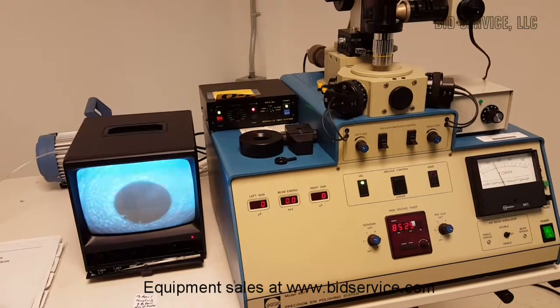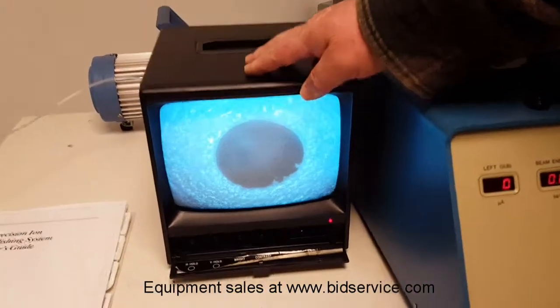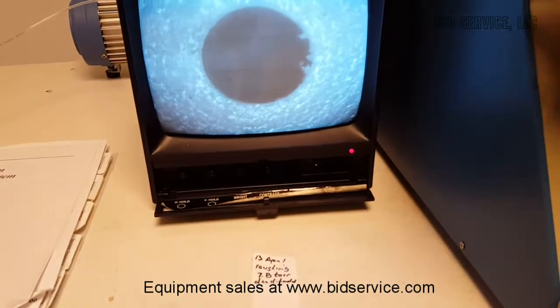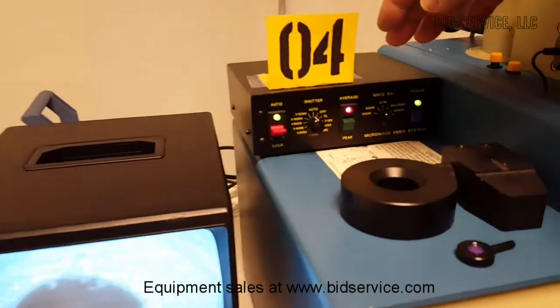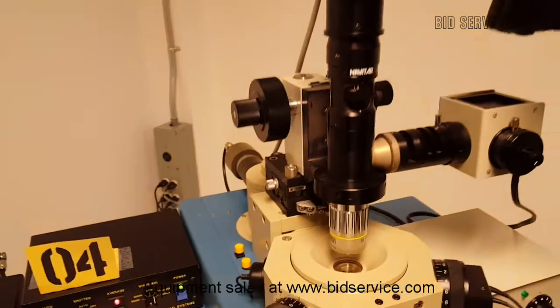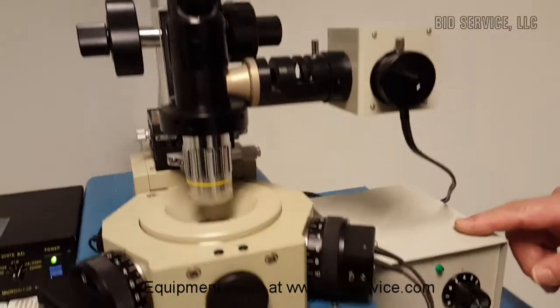This demo is for the Gatan 691 Precision Ion Polishing System. I'm just going to go over the components. This is your monitor for your camera — as you can see it's right now on the specimen holder, and it's rotating. Over here are your camera controls, up top here is your camera, and over here is your light source and your power supply.